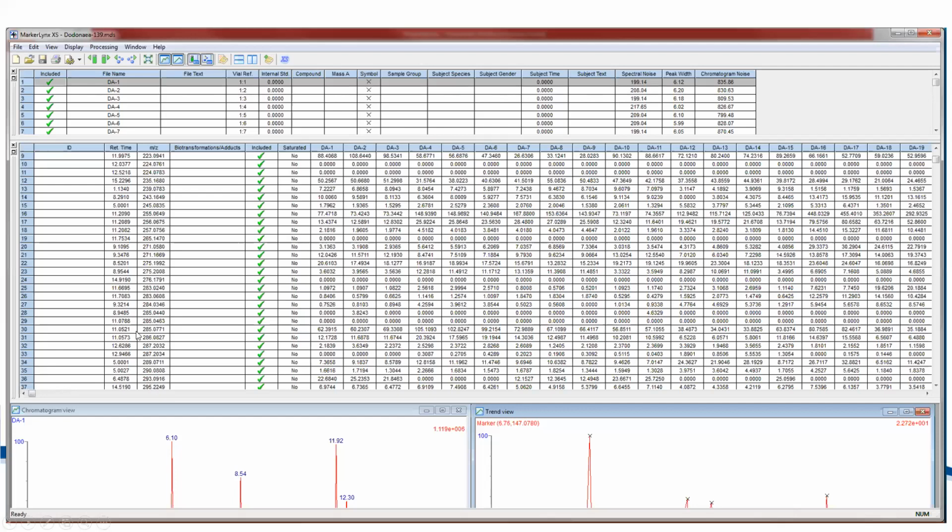So in this spreadsheet, in terms of LCMS, you have your retention time and your mass charge. So this pair is a retention mass charge pair. And then these two columns, retention time and mass charge, and then we have columns going the other way. These are your samples. Okay, and the readings here, your data matrix comprises the intensity of each of these pairs. So this is what we're varying, and then this is what we want to analyze in our data set.